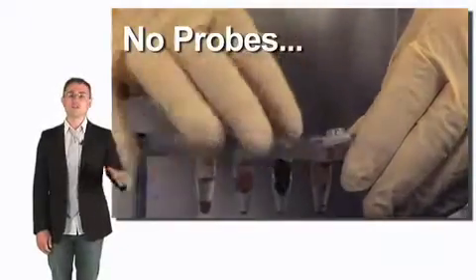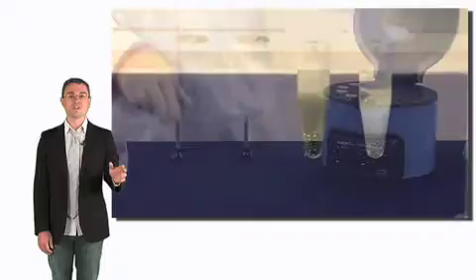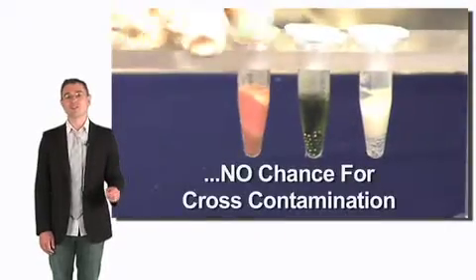No part of the Bullet Blender ever touches your samples, and even the tubes never contact each other, ensuring that you'll never have cross-contamination.